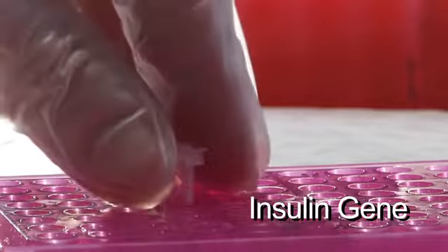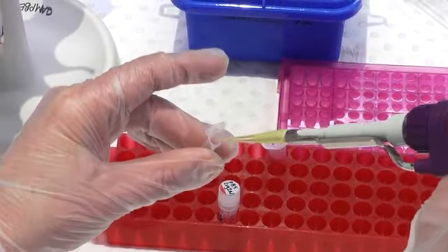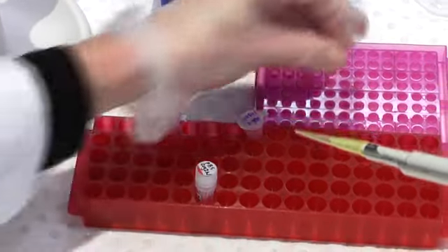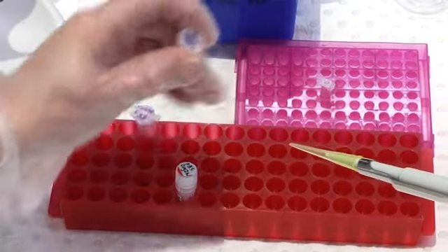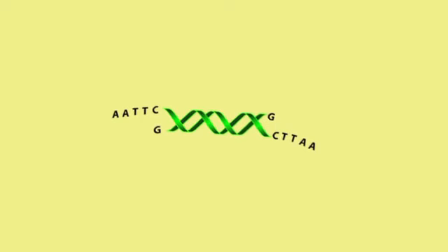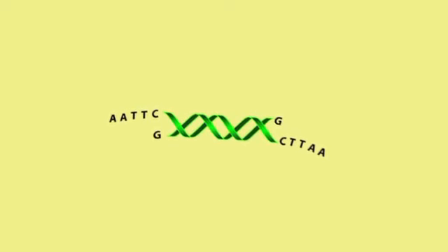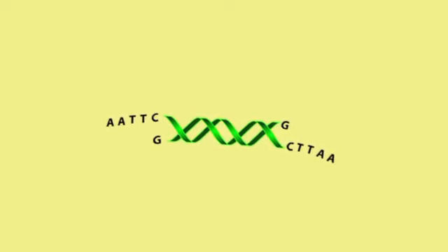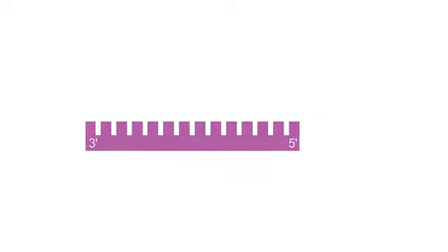I then take a sample of the insulin gene that we generated earlier, and add it to the second tube. The restriction sites at either end of the insulin gene were added as part of the PCR process. When we designed the primers to amplify the gene, we simply added the restriction site to the five prime end of each primer.